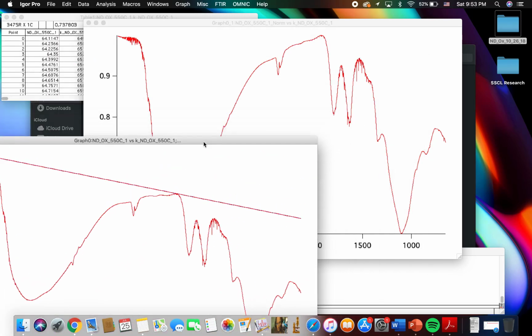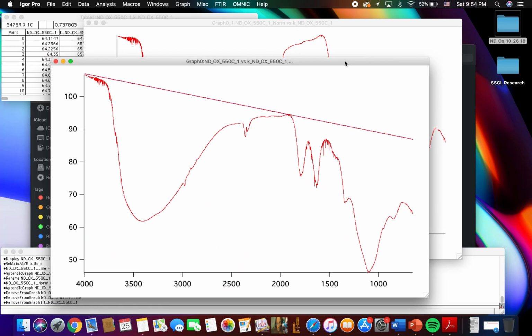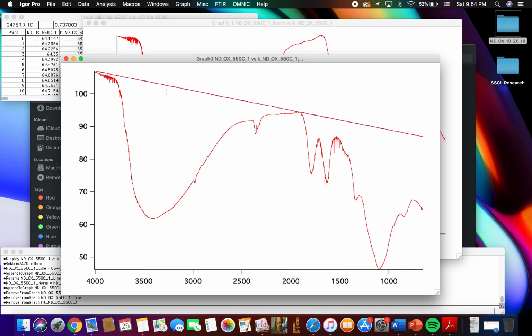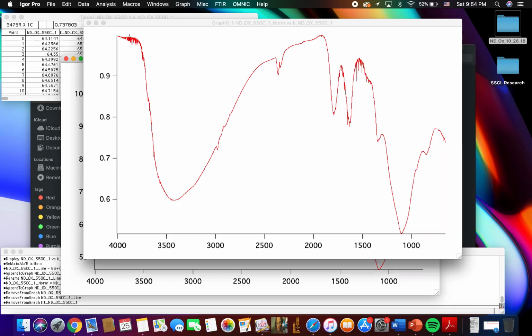See, it's just gotten smaller. The Y wave's a little smaller. The trace of it is a little different. Like you have this kind of matching this area. As you can see, like here, it's kind of connected. So you can see what you are doing when you connect these points. You're kind of normalizing the data, so it all kind of matches through. So it's great. It looks good.